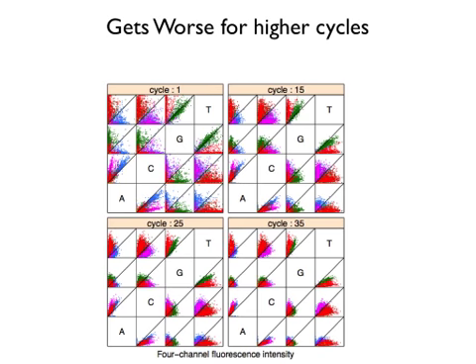Here are the same pictures as you go down the cycles, and look at how the signal is being lost. It starts with high numbers, but as you go to the later cycles, some of these are basically impossible to call. They're just a mush of points. So, to answer your question about 6,000 versus 1,000, it looks like there's just natural variation here. You see how you can get very high numbers and very low numbers? This is, I think, on a log scale, so these will be like 4 times bigger than those.